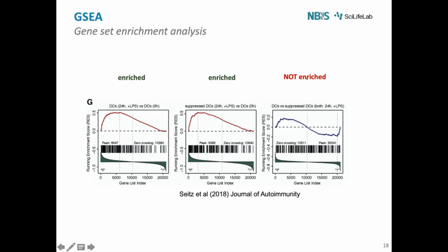In this one, for example, it's not enriched because now, rather than a complete shift, you have a normal distribution in that sense. So it's enriched in the beginning and then enriched in the end. And you can see that the genes here are evenly distributed across all the ranked gene lists that I used as input. While in these ones, the genes are more highlighted in the beginning.